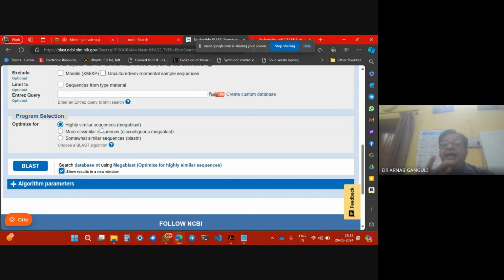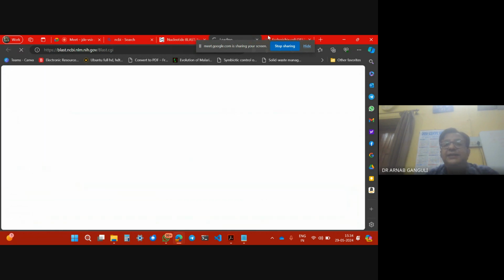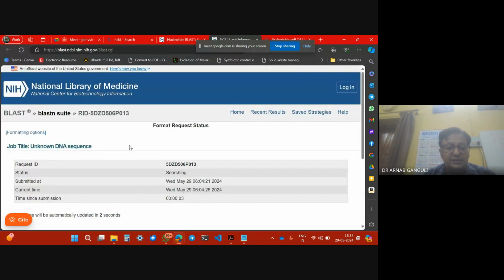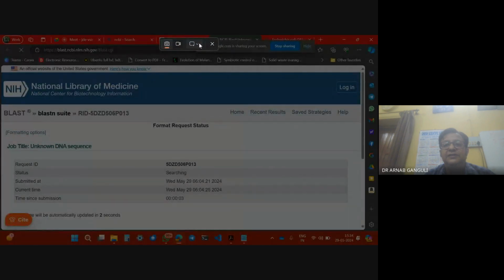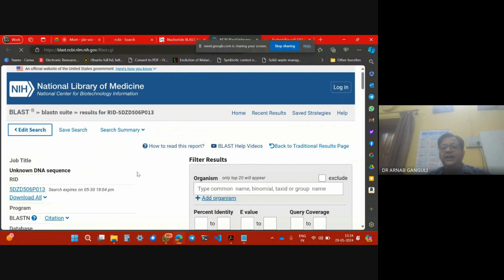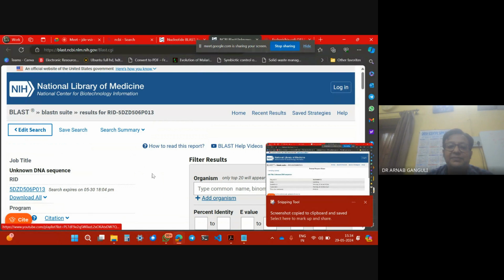I have to find out what this DNA is first of all. We don't know anything about it. And you do a blast. It's opening in a new window. The job title is still going on. It's searching, and here the result has come up. Okay.